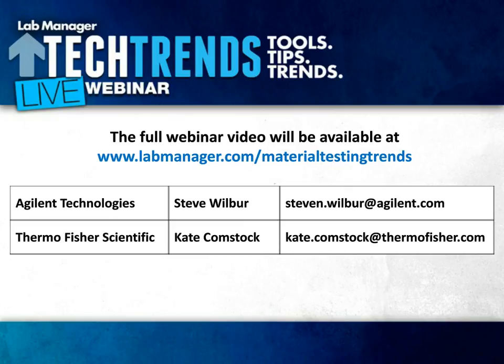And Steve, does the nanoparticle method wizard that you mentioned work with all the Agilent ICP-MS models? It does. It works with all the currently supported models. It requires an upgrade to the most recent version of MassHunter software, which also supports all the current models.